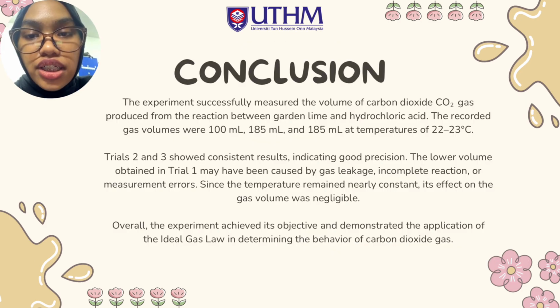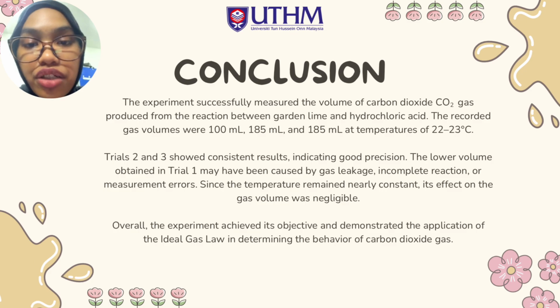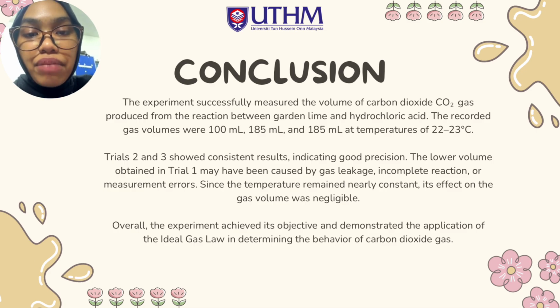The conclusion for this experiment is the experiment successfully measured the volume of carbon dioxide CO2 gas produced from the reaction between garden lime and hydrochloric acid. The recorded gas volumes were 100 ml, 185 ml, and the same one for the third one, 185 ml at the temperature of 22 to 23 Celsius.